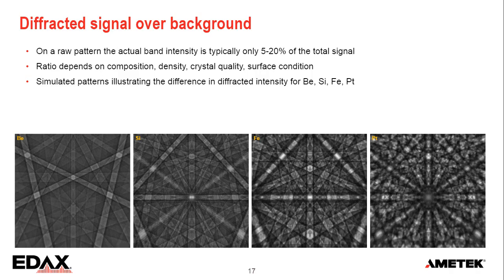One thing to keep in mind is that the material needs to be crystalline. A lot of the things I've seen are not fully crystalline. There may be more polymers that don't have the longer range ordering that we need to get EBSD patterns. But yeah, it's something that I'm experimenting on.